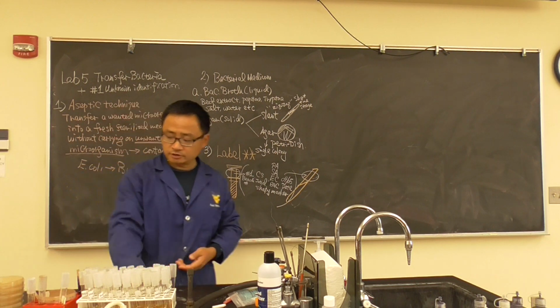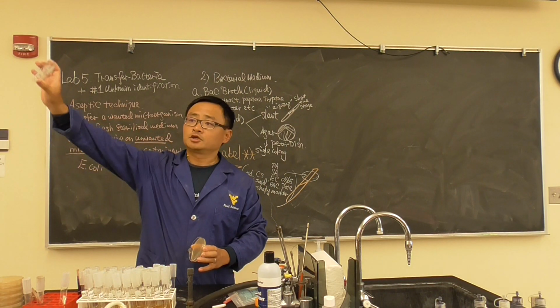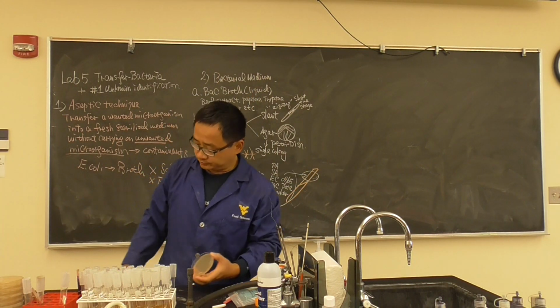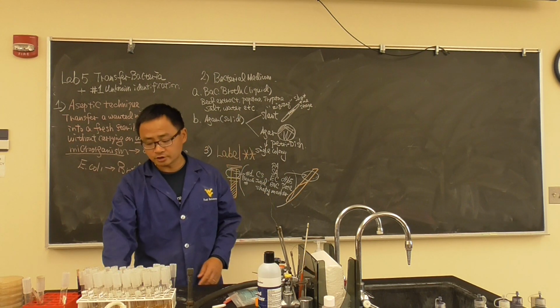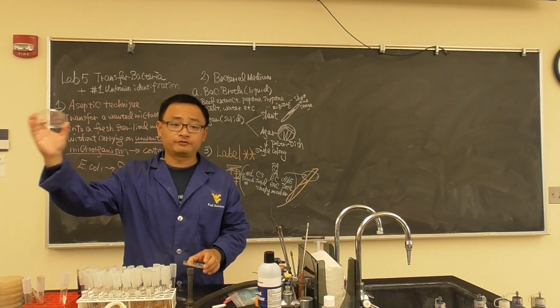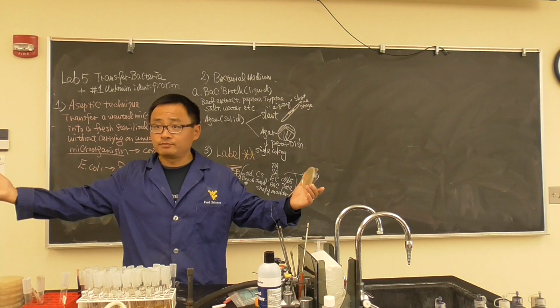Now here is a question. This is an agar. You have a lid, you have a bottom. Where should you label? Can you tell me? Bottom, is that right? Yeah. You should always label at the bottom. Why? If you label on the top, the lid falls off, you don't know where it is, and you mess up everything.